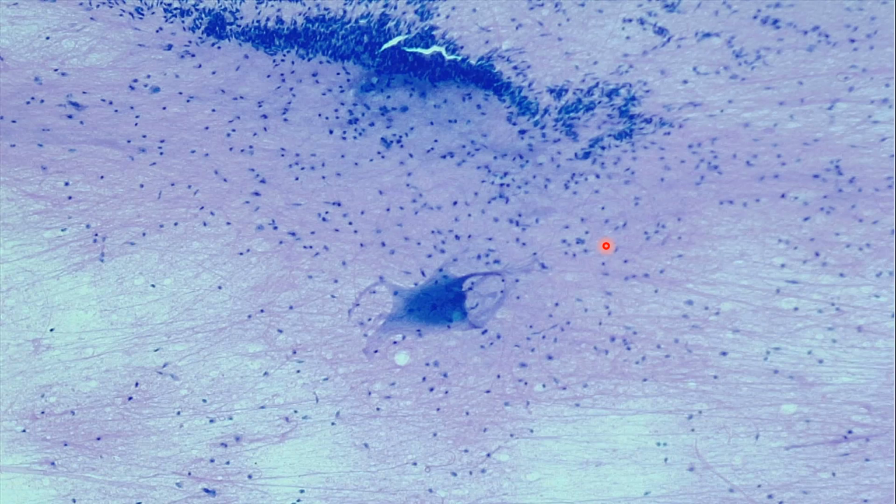So, very straightforward. We have some neural tissue here. One of the things that we actually have are a neuron, okay? So to me, a neuron looks like a blue booger.